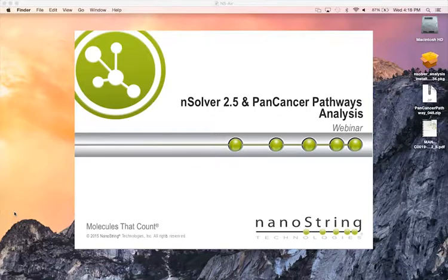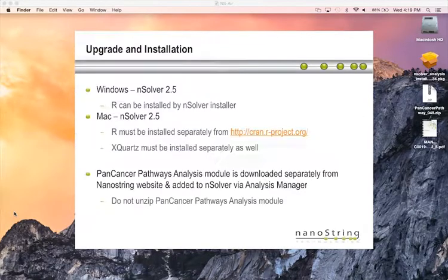Rather than perform the analysis and visualization of the sample data within nSolver, the data are automatically exported to an open source statistical environment called R. nSolver is used to adjust the settings for each advanced analysis as well as to manage and launch the resulting visualizations. No familiarity with R is necessary to use the advanced analyses supplied by NanoString.